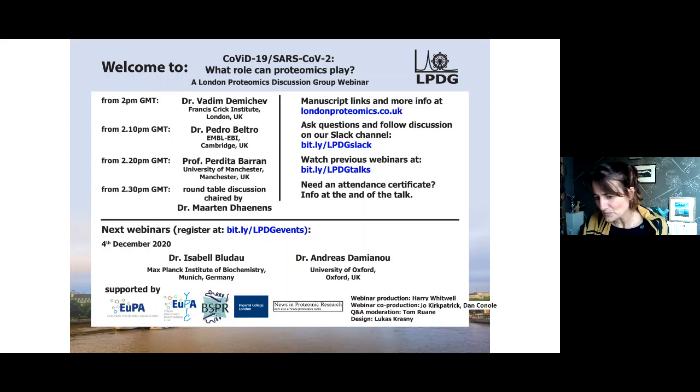Mm-hmm. Yeah, I think I read it too fast. It was too late at night, but I read something about indeed the new outbreak. So you think mass spec will be able to be one of the first to maybe look at it? We're looking at whether those peptides are commonly seen in the spike. I mean, it's in the spike region. It's quite high up in the spike region, so I'm not sure. But we're looking to see if we find them, and then that would be possible.